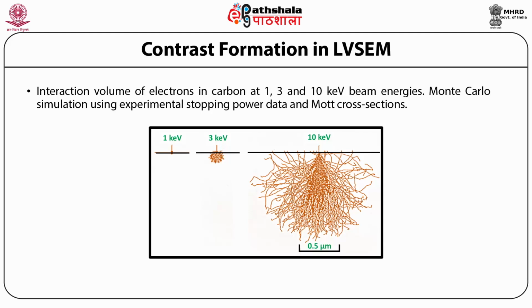Here, the topographic contrast is modulated by the detector contrast effects to produce the characteristic shading that makes surface topography readily interpretable. The features of the sample comparable to or smaller than the beam range are filled by the interaction volume, producing enhanced secondary electron emission that contributes to the three-dimensional appearance.